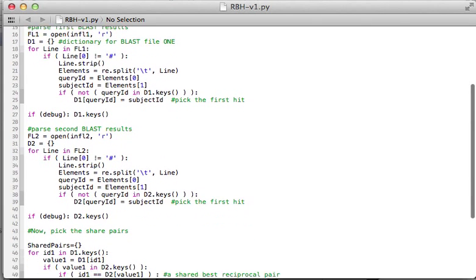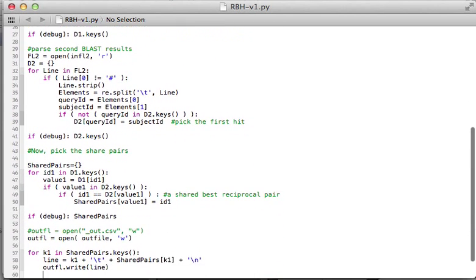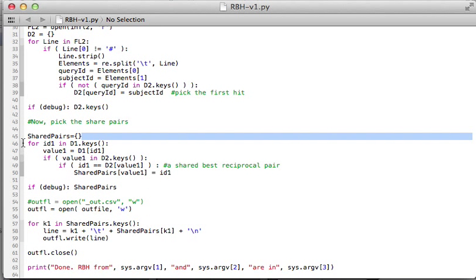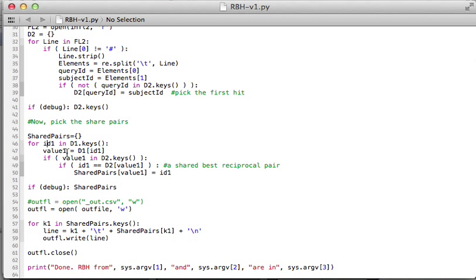Now here's the key: how do we pick the shared pairs? I'm going to set up an empty dictionary called shared pairs, and then I loop over all the keys in the first dictionary D1. So I call this ID1, and its value will be value one. If the value one is in the keys of the second dictionary, and the ID1, which is key one, is also the value of the second dictionary, then it is a shared pair.